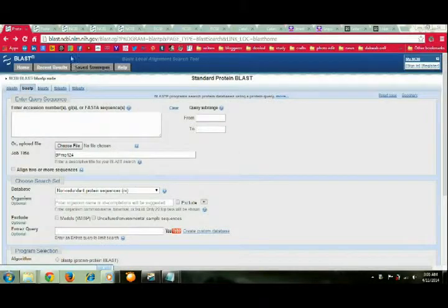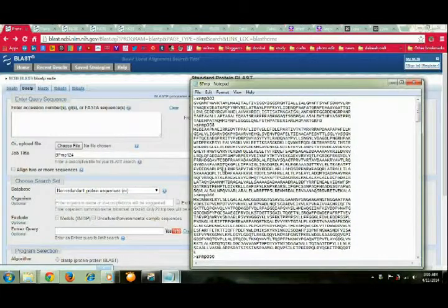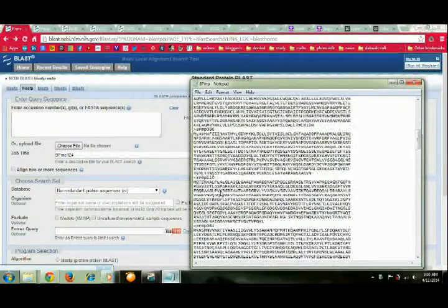Beneficial using Protein Blast to get conserved domain and alignment. The first thing that we need is the sequence of interest. These sequences are provided in your email.